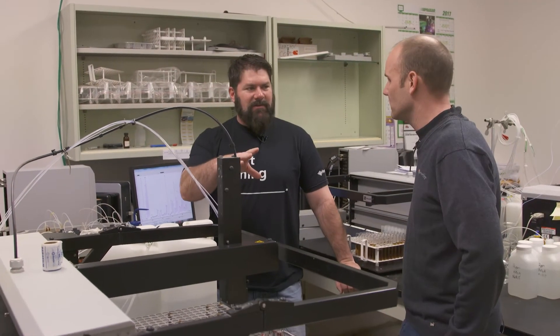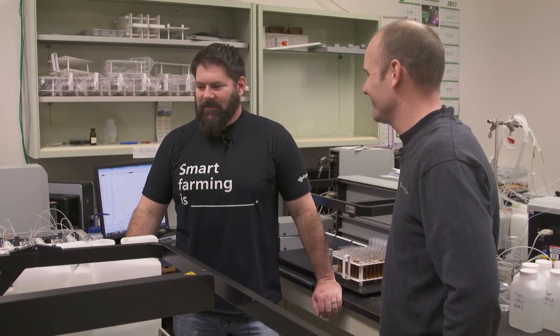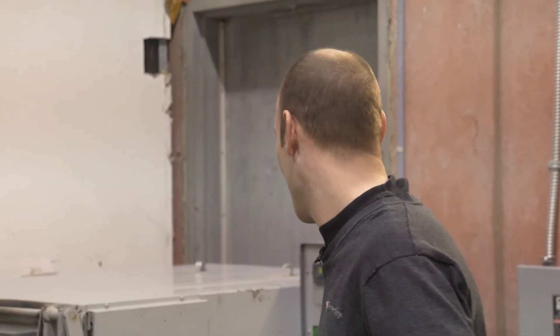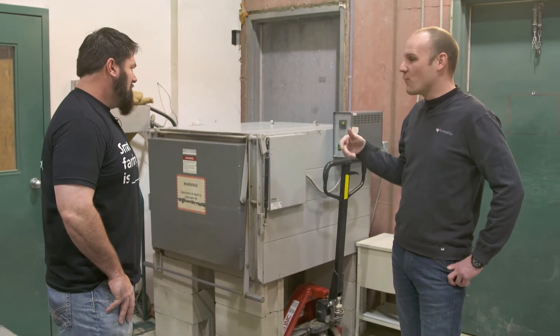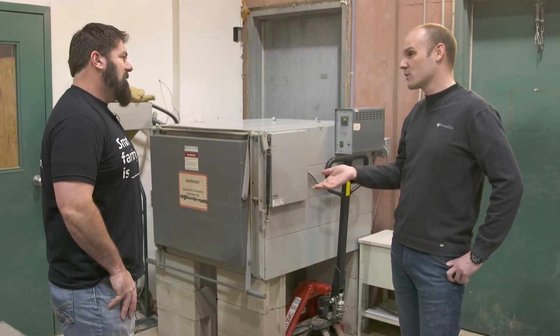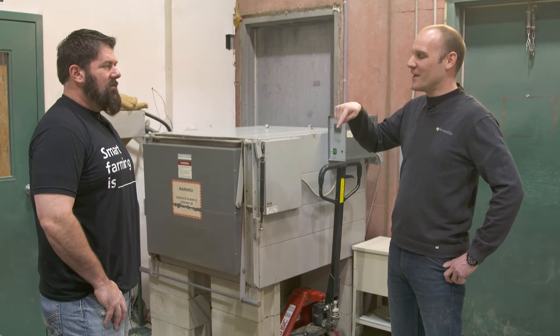I've got a farmer question: when you ground the dirt and sifted off all the stuff on top, how do you test for organic matter? This is what we call a muffle furnace — a high-temperature furnace. We run it at about 375°C. The organic carbon — what everyone calls organic matter — starts to oxidize at that temperature. When you oxidize carbon, you get carbon dioxide, which is a gas, so it leaves. We put it back on the balance, measure it very precisely, and that percent mass lost is your organic matter. You're weighing the loss of the carbon that has evolved into carbon dioxide.